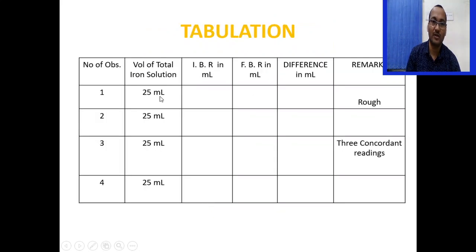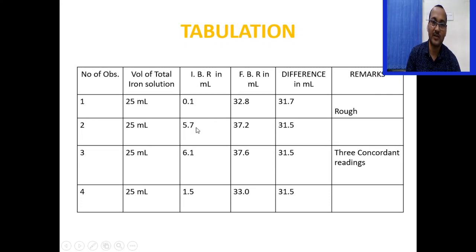For the total iron titration table: volume of iron solution pipetted out was 25 ml. Record initial burette reading, final burette reading, and the difference each time. For example: IBR 0.1, FBR 32.8, difference 31.7 (rough reading); next experiment gives 31.5; subsequent experiments also give 31.5. So 31.5 ml is the concordant reading for total iron.